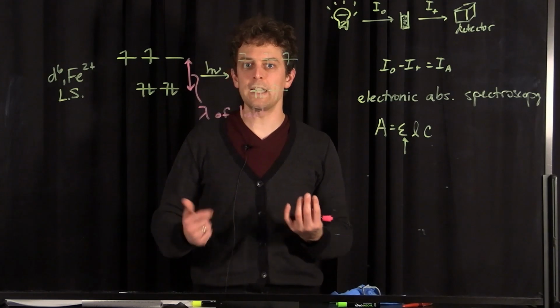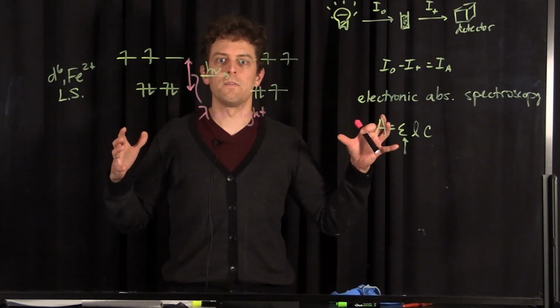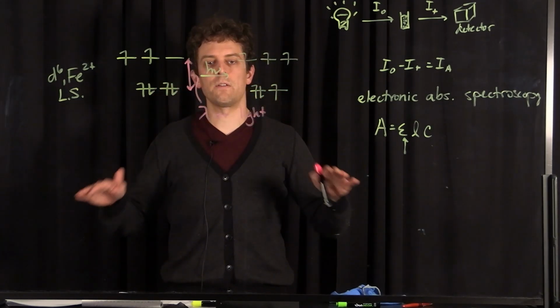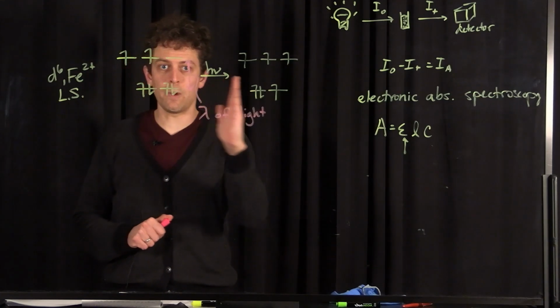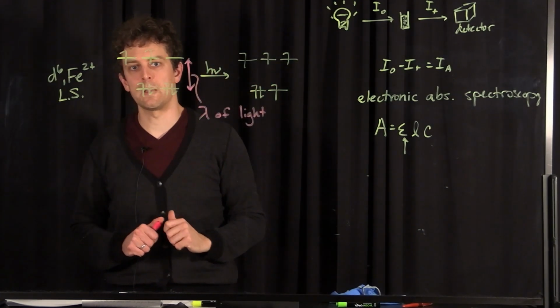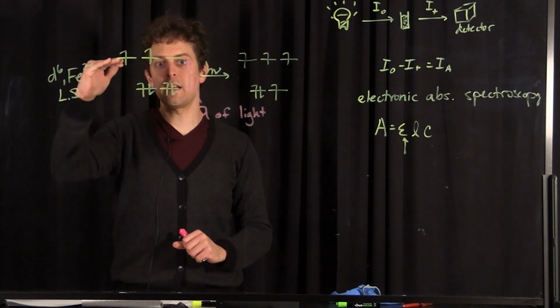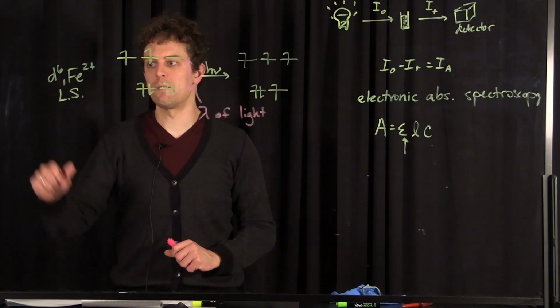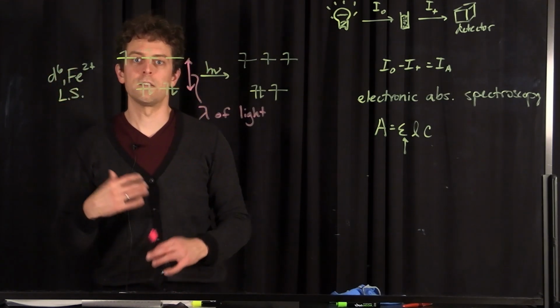These are all quantum states, and that absorption of light is quantized, but when you put them into environments with temperature, you spread that out and get a Gaussian curve because of that. But ultimately, the peak wavelength that you see is going to be shifting around, and that is the thing that's most related to the difference in energy between these two. That energy is going to be different depending on the identity of the metal ion, the oxidation state of the metal ion, and several other things.